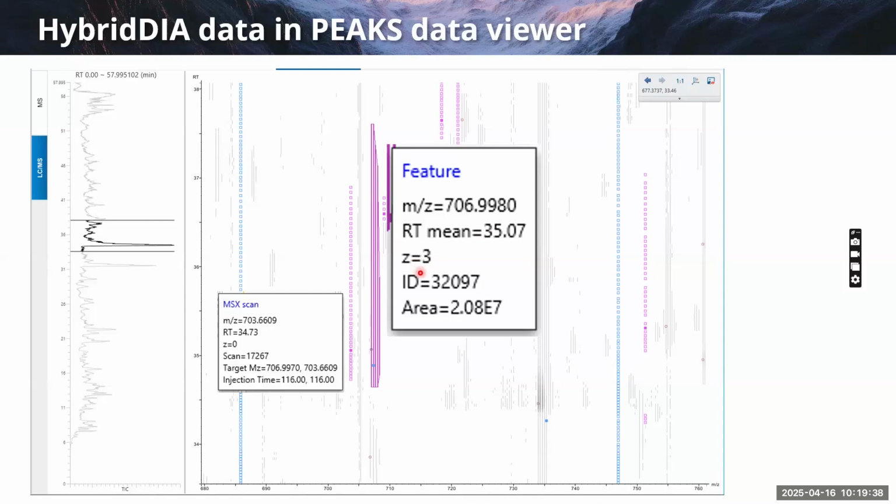And also, since here we have the PRM scan, we go to that. For the instrument, at first it checks our target. Here we spike the heavy peptides, and this is the endogenous one, which we also call the targeted peptide. So the instrument first finds the labeled peptide, then does the MS2 and checks the fragment ions to confirm this is the real peptide.